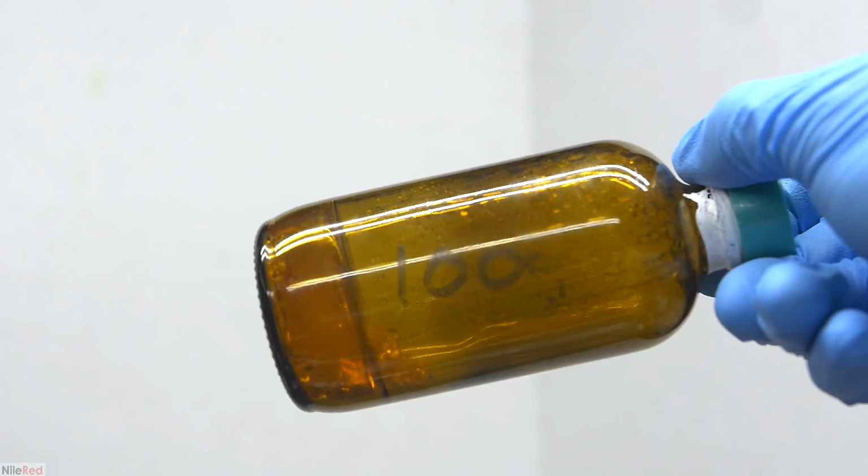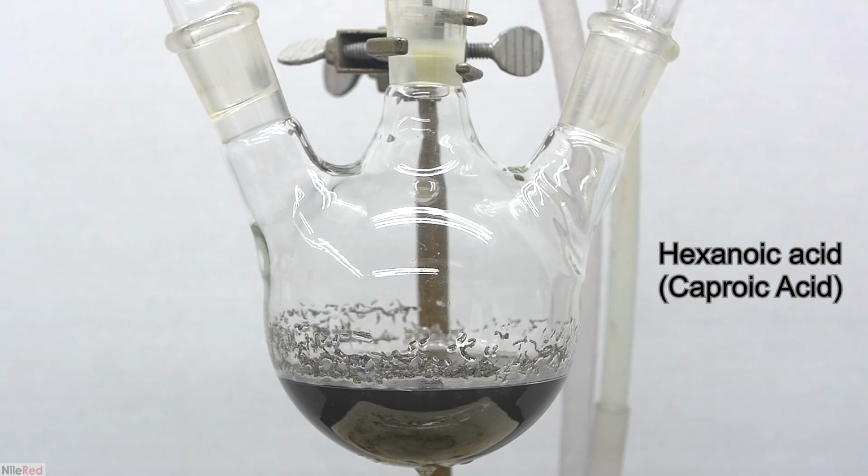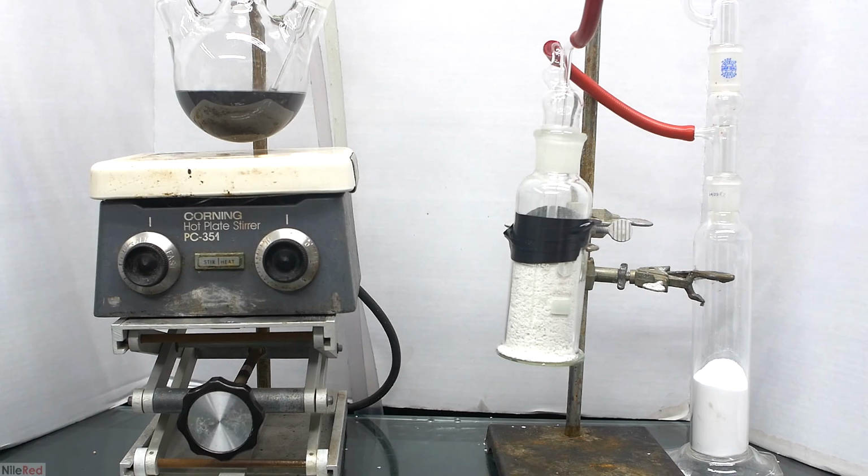I went through all of my chemicals to try to find something that I could react to make something cool, but I didn't really find too much. In the end, I decided to just react it with CO2 gas, because this would make hexanoic acid, which I thought could be cool because it stank, and it actually does have some chemical uses. There are two main ways to generate CO2 gas, either by CO2 dry ice pellets, or chemically using an acid and a carbonate base. It took me about 5 minutes, but I rigged together a pretty quick system.